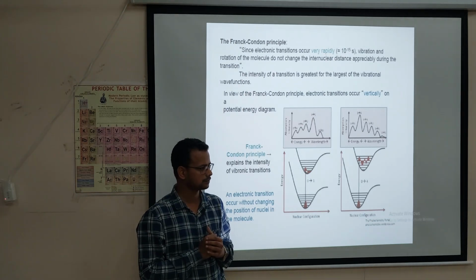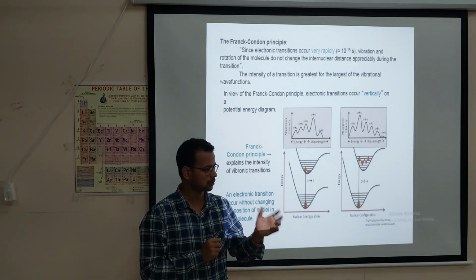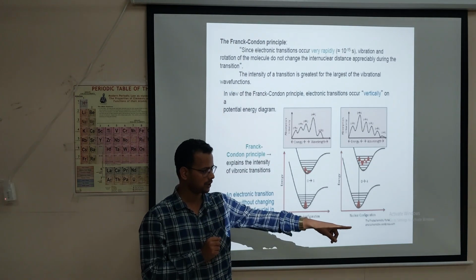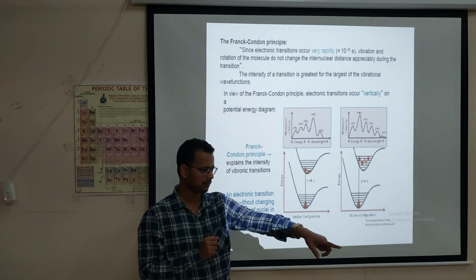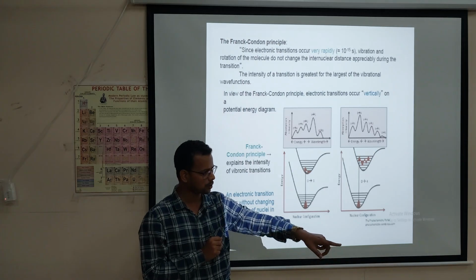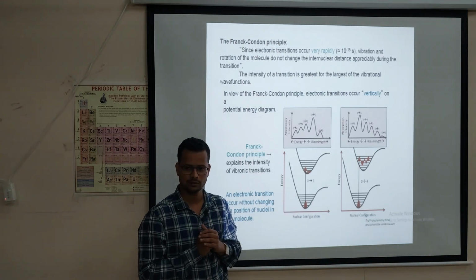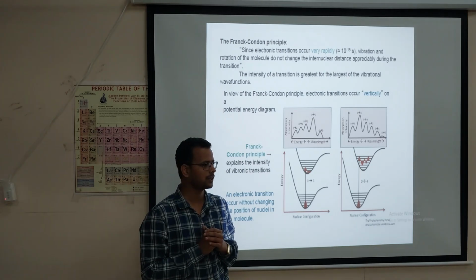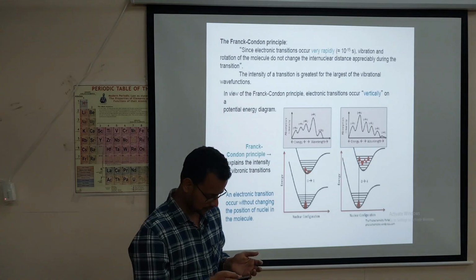In a liquid sample, someone will ask you the concentration. If 3 or 4 samples are there, which is more concentrated? By testing in UV-Vis, you can tell which is more concentrated through absorbance. But in a solid sample, no one will ask you the concentration of the sample. They will ask you the band gap of the sample. Clear? Or any doubt? No doubt? Okay.